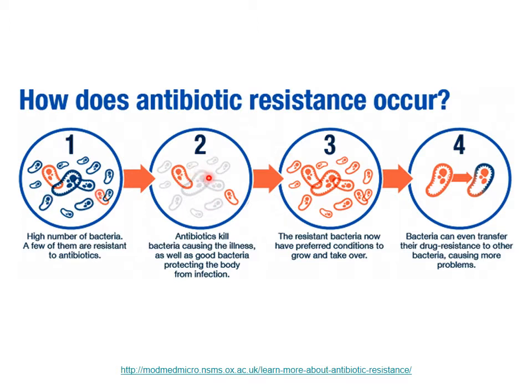And so we see these fainter gray ones, these are the bacteria that have been killed. But those that are resistant, these orange ones, will survive. Now, when this happens, the population dynamic has changed. There used to be, in circle 1 over here, mostly sensitive bacteria shown in blue, and only a couple, or very few, resistant bacteria. When those sensitive bacteria are gone, now the resistant bacteria will repopulate whatever environment that they're in, and most of what is going to exist after these bacteria start to regrow and repopulate will be bacteria that are now resistant.